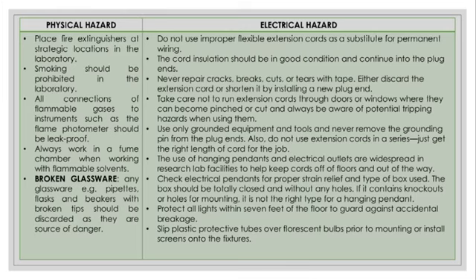Okay, next for the electrical hazard, do not use improper flexible extension cords as a substitute for permanent wiring. The cord insulation should be in good condition and continue into the plug ends. So never repair cracks, breaks, cuts or tears with tape. Either discard the extension cord or shorten it by installing a new plug end. Take care not to run extension cords through doors or windows where they can become pinched or cut, and always be aware of potential tripping hazards when using them.